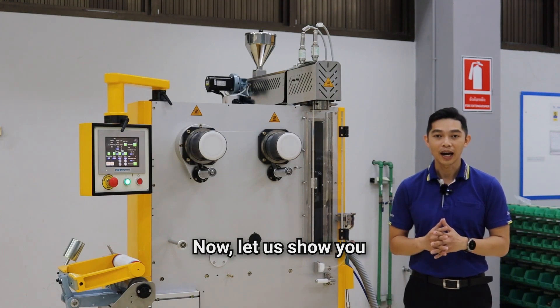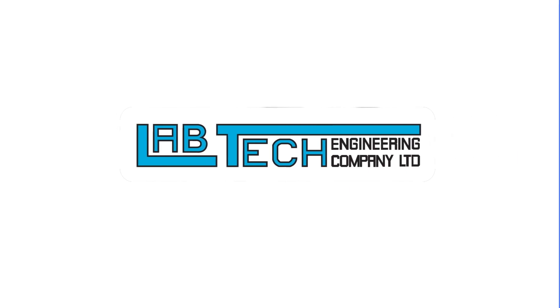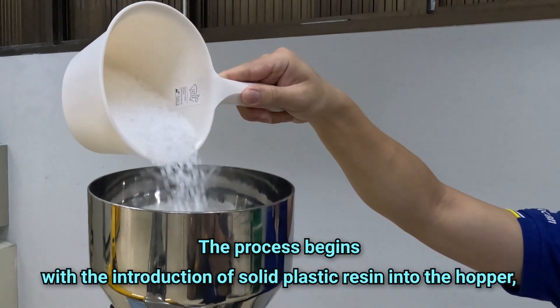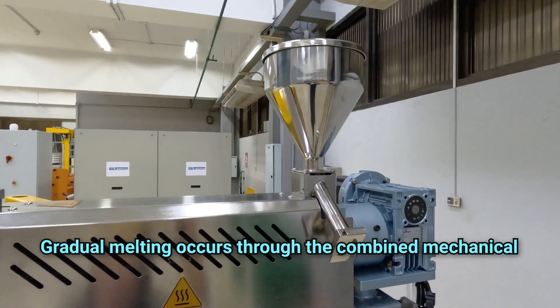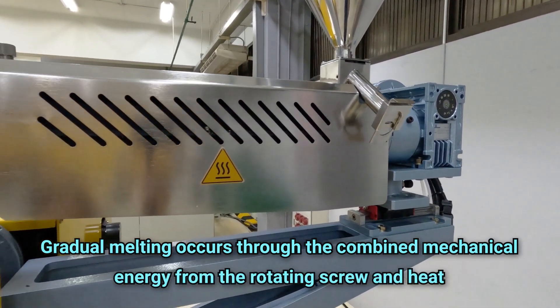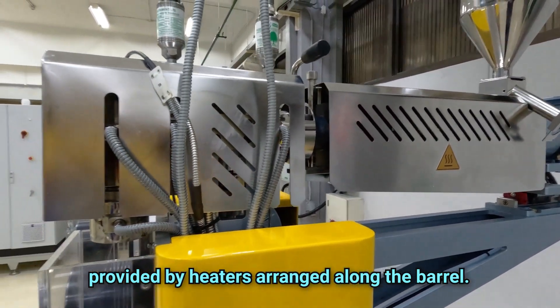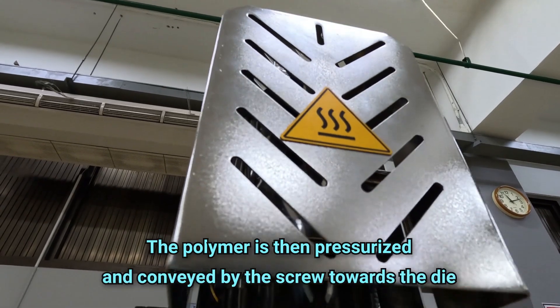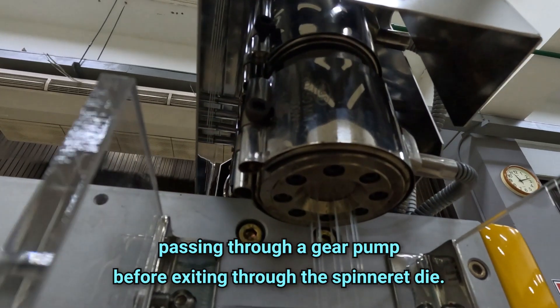Now, let us show you how this mini melt spinning line operates. The process begins with the introduction of solid plastic resin into the hopper, which then enters the barrel. Gradual melting occurs through the combined mechanical energy from the rotating screw and heat provided by heaters arranged along the barrel. The polymer is then pressurized and conveyed by the screw towards the die, passing through a gear pump before exiting through the spinneret die.